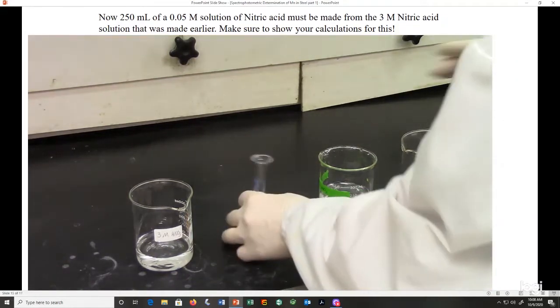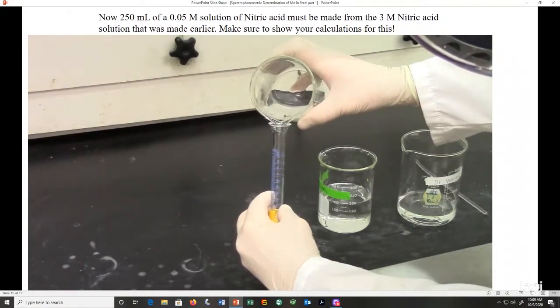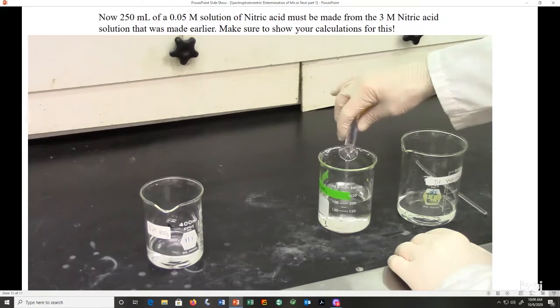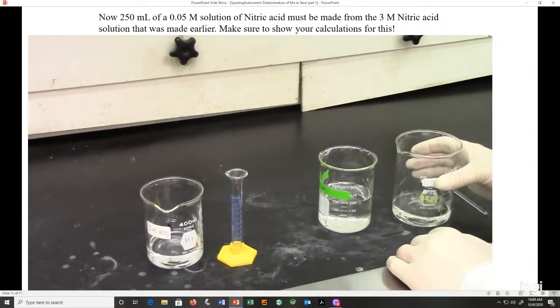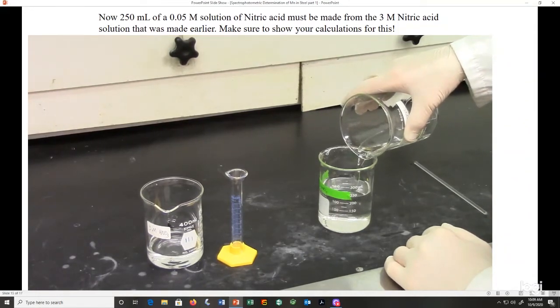So for this one, an ice bath isn't necessary. We're just going to be adding a little bit of 3 molar nitric acid to about 200 milliliters of water. And then we're just going to bring that up to the 250 milliliters with more deionized water.